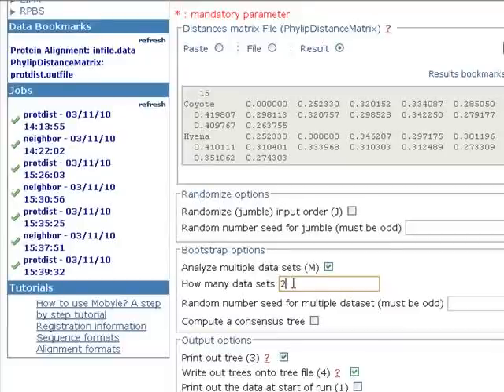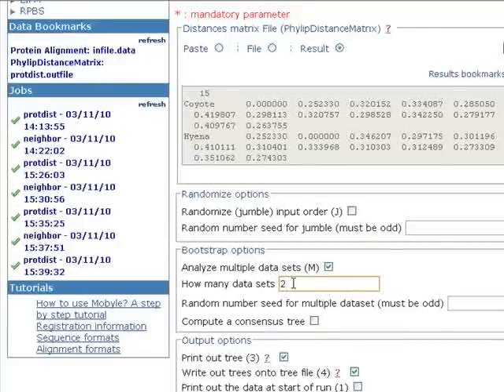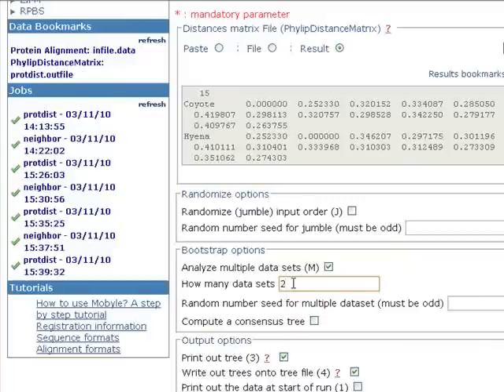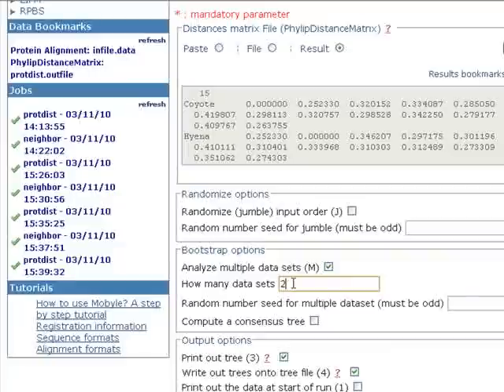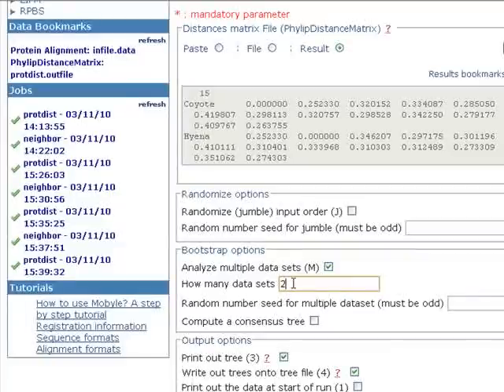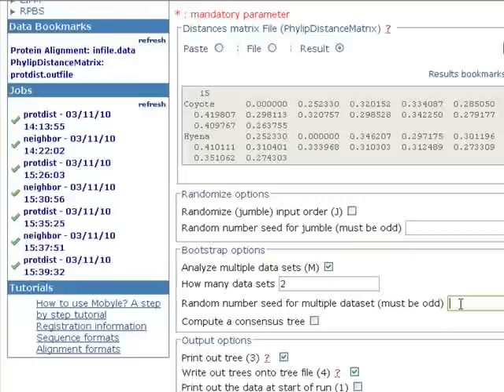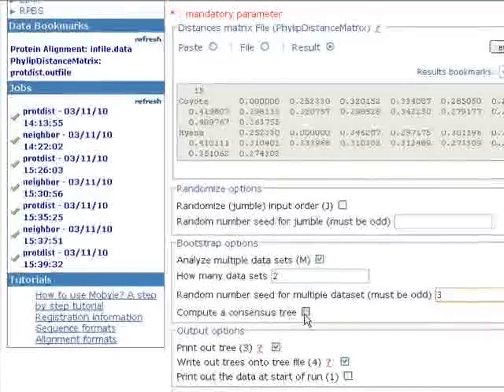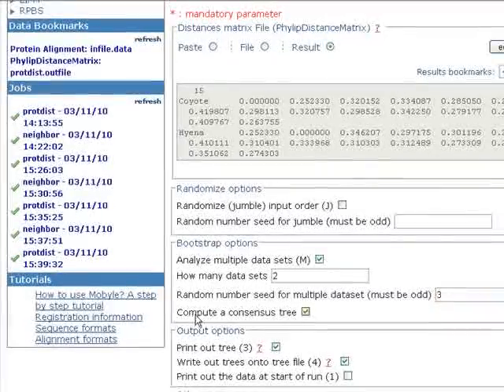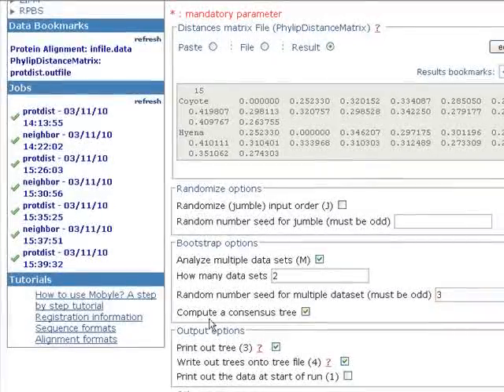I advise you if you're not just testing this software, if you're trying to construct a phylogenetic tree from your multiple sequence alignment, this number should be at least 100. Here the random number seed for multiple data sets is like three, and we check this option which is compute the consensus tree.